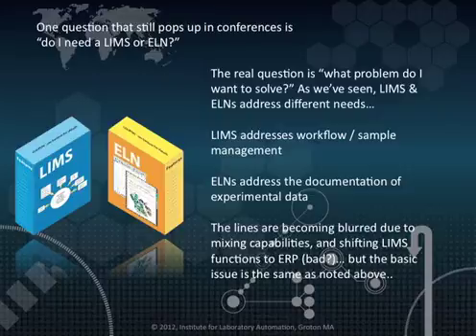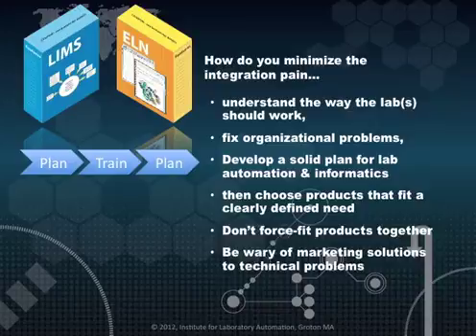For one thing, it mixes laboratory data with production data and can cause problems with system security and access. It breaks down a barrier that should exist between production and quality control, that is, controlling the availability of data until it is reviewed and approved for release. It also means that changes to the system, including upgrades, can have a drastic effect on laboratory operations, particularly if instrument connections are made.